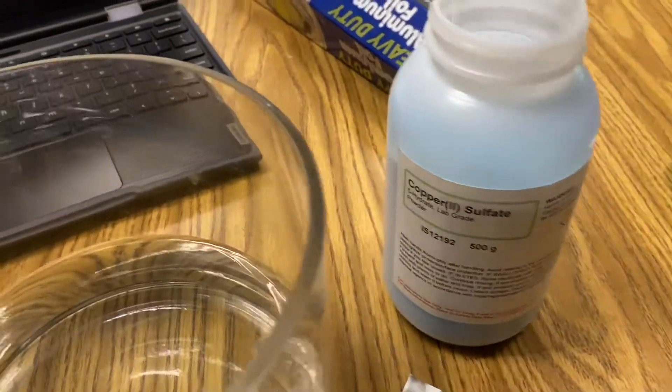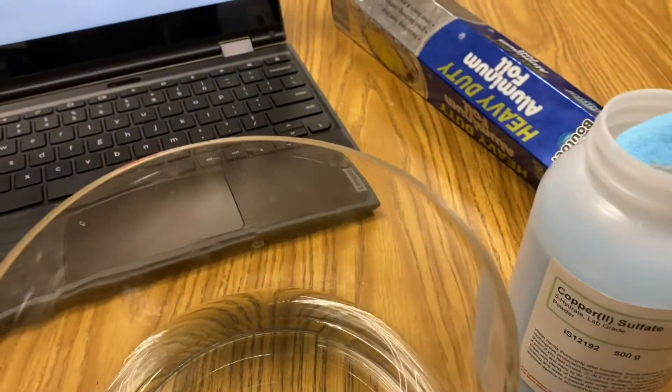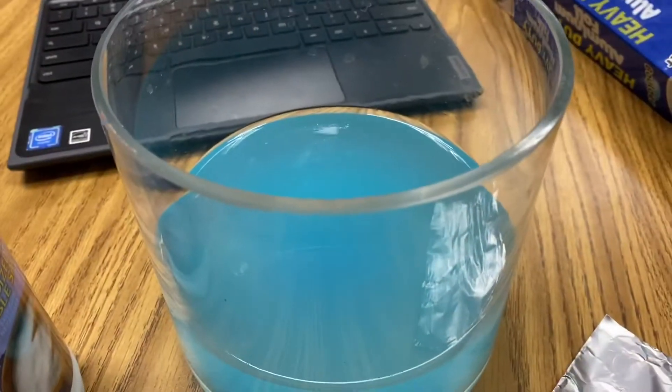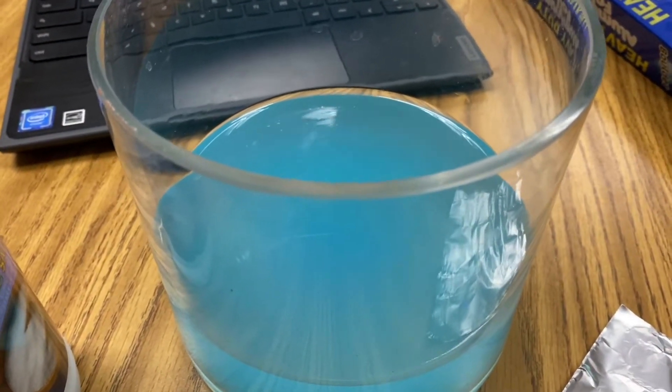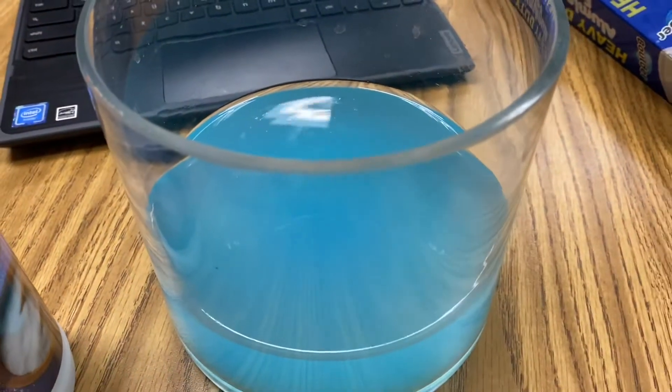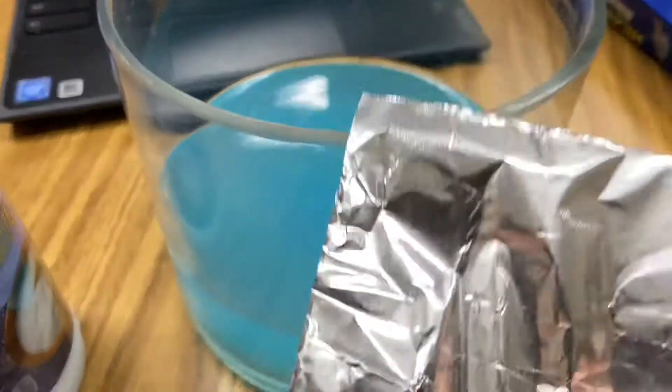The first step in this reaction is to dissolve a few spoonfuls of copper 2 sulfate in distilled water. So right now I have a solution of CuSO4, my copper 2 sulfate, and I want to displace the copper using aluminum.